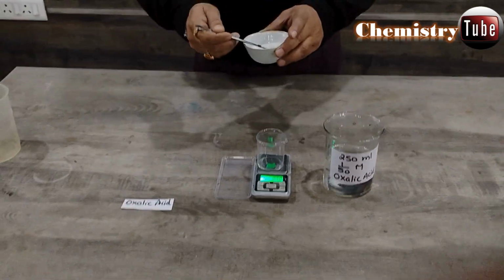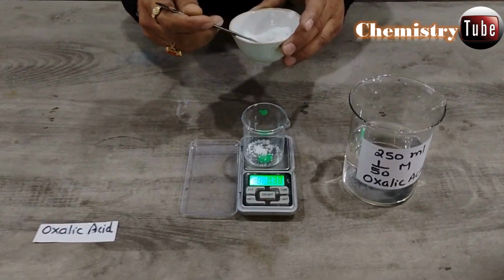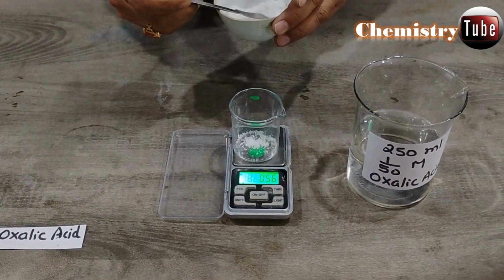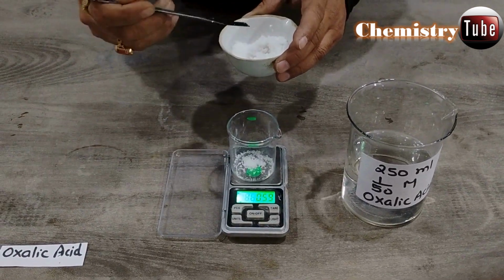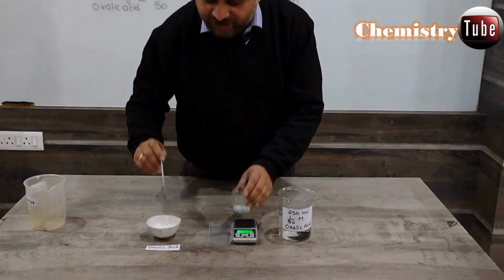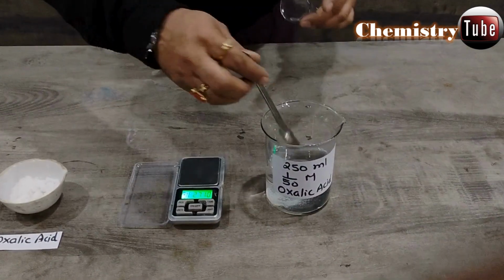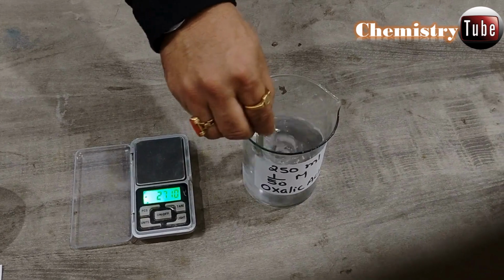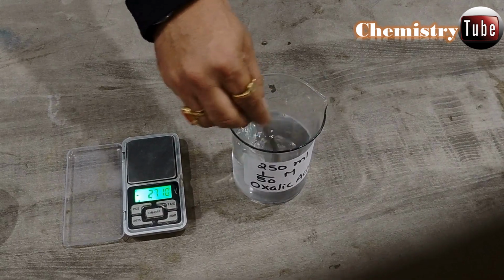Now we have to weigh 0.63 gram of oxalic acid. You can see it is 0.38 gram. We require a little more oxalic acid. Now the weight is 0.56 gram. Now it is 0.60 gram. Now the weight is 0.64 gram. Finally, we will transfer this oxalic acid into this 250 ml of water, and we will carefully stir this solution so that we have 250 ml of 1/50 M oxalic acid solution. This solution is ready now.